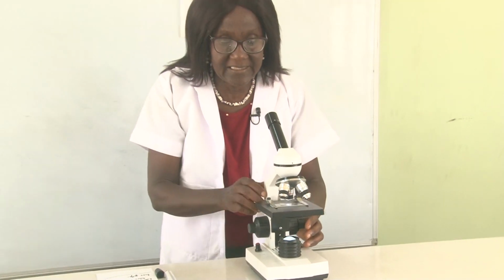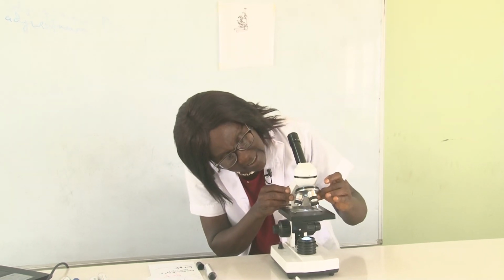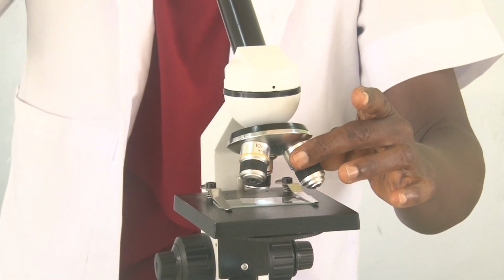In our last lesson, we used the microscope, focused it to look at the specimen under low power. So we are continuing from there. You have looked at the specimen at low power. We now want to turn to look at the specimen under high power. And the high power lens is this one, 40 times. That is what we want to do.